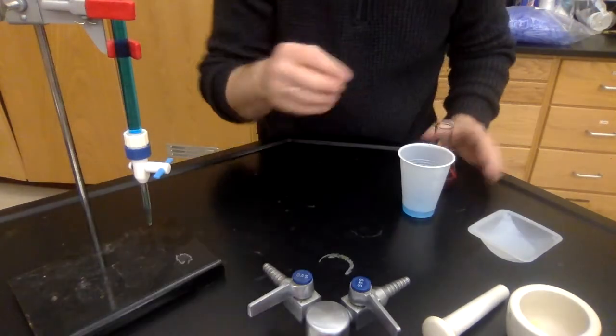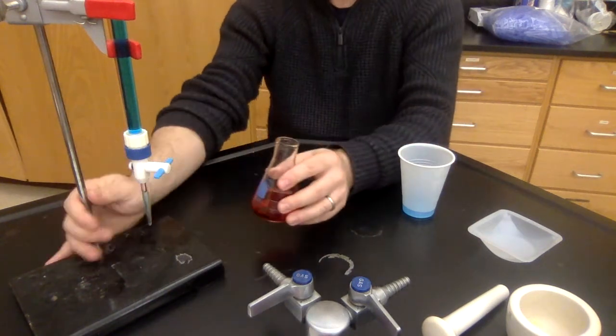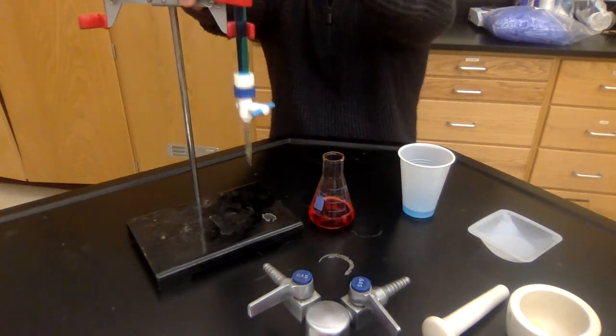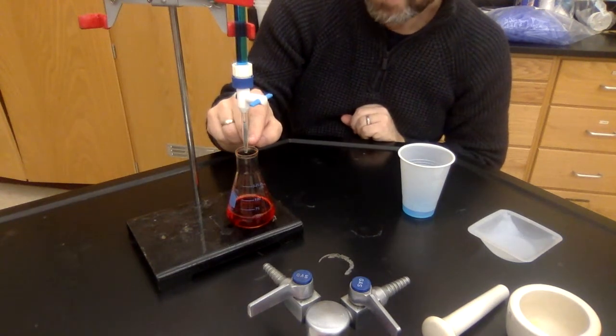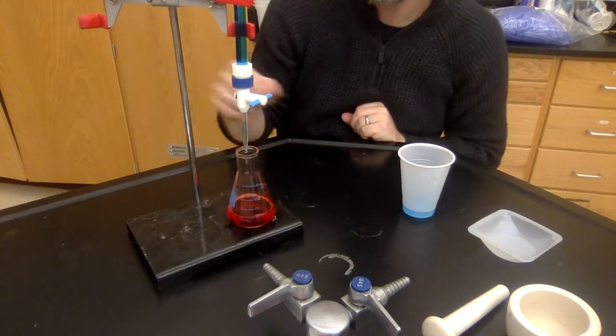So you always have a little freedom to adjust if you need, but here's my amount. What I'm gonna do is adjust the height of this here. I'm gonna go extra tall for a moment, and I'm gonna slide this under, and I want the tip of this to be just under the lip of the Erlenmeyer, okay?